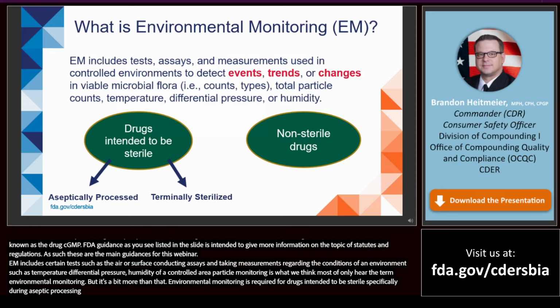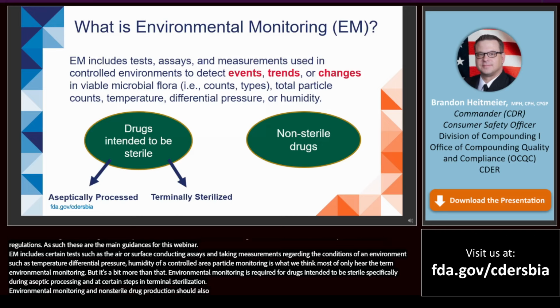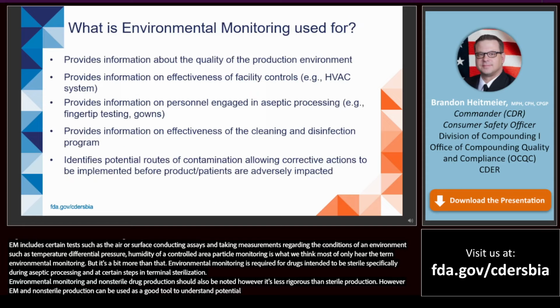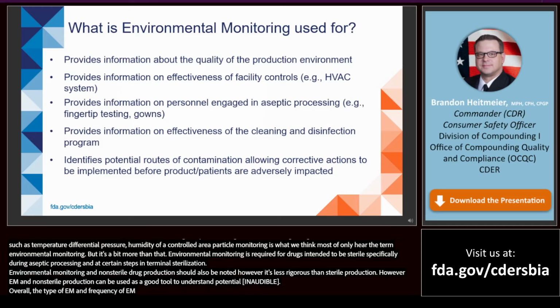Environmental monitoring in non-sterile drug production should also be conducted. However, it's less rigorous than in sterile production. However, EM in non-sterile production can be used as a good tool to understand bioburden levels and potential routes of contamination. Overall, the type of EM and the frequency of EM or testing depends on the type of drug production, the type of operation, and should be commensurate with whatever risk that operation poses.